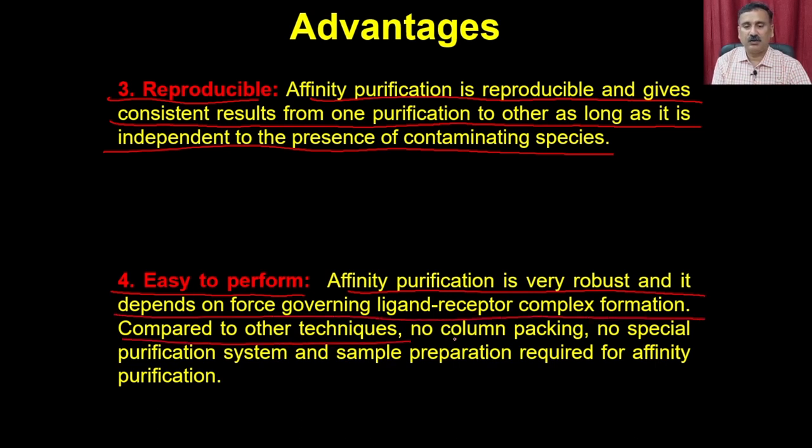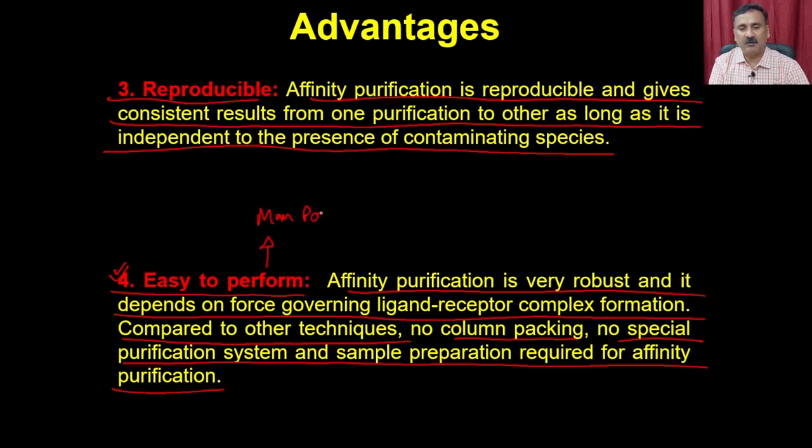Compared to the other techniques, no column packing, no special purification system and no sample preparation is required for affinity chromatography. And this is very important because it saves your time for training manpower, and that's how anybody can do affinity chromatography without much training.